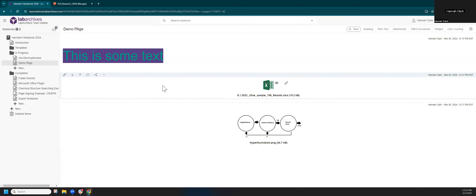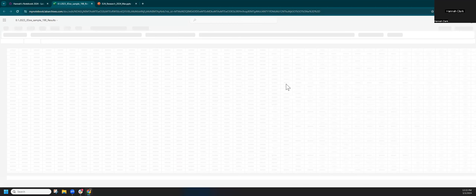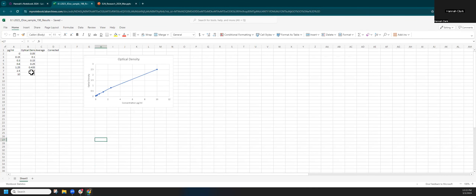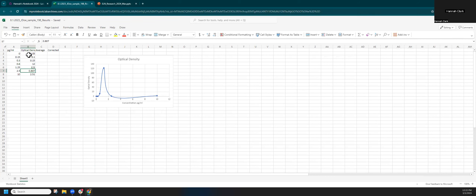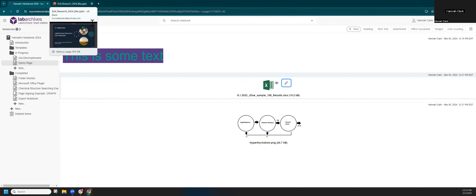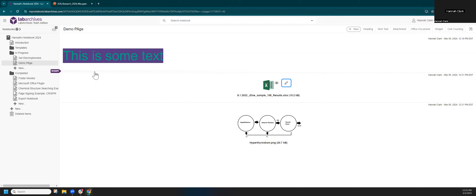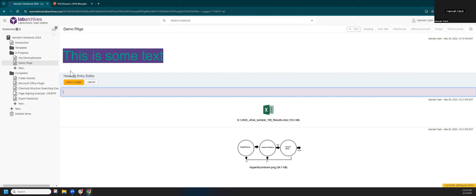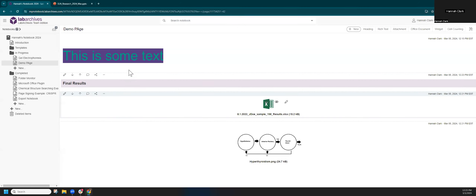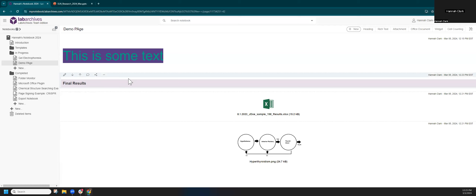The pencil icon lets you edit an entry. For an Office document, clicking pencil opens Excel Online, where I can make changes — it supports simultaneous editing, so several people can work in the same file at the same time, and everything saves back to Lab Archives. When I close, all those details come back to the notebook page. To insert in a specific location, hover your mouse between entries to see the insert flag. I'll add a heading called 'Final Results' to divide up the page visually.